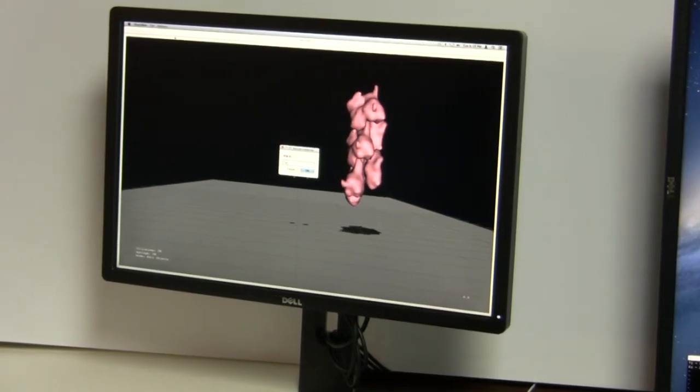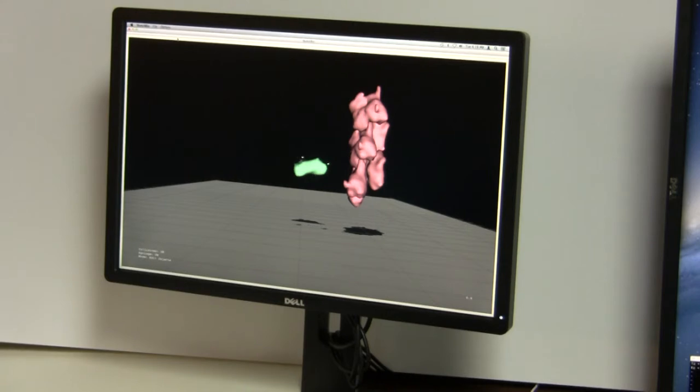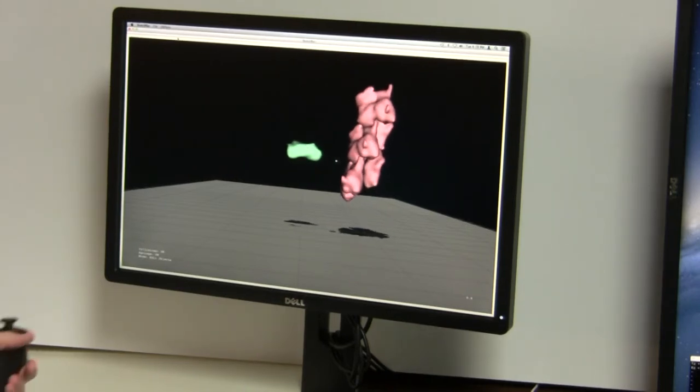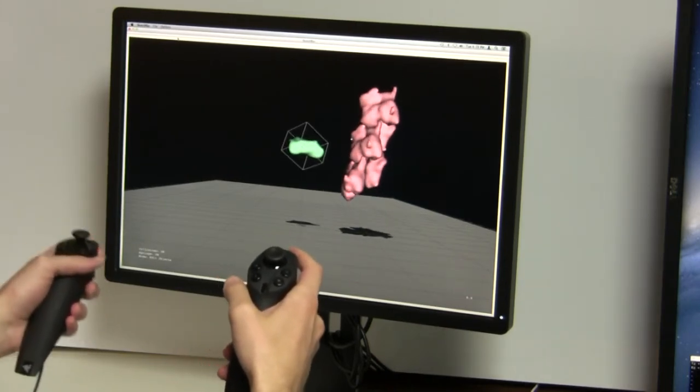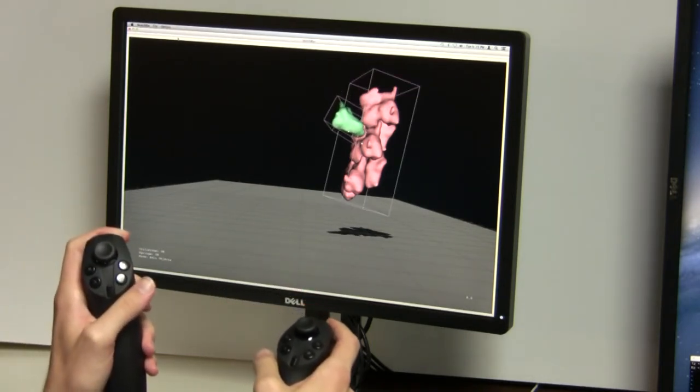The Sketchbio project provides an integrated 3D environment for loading and posing macromolecular structures. Its natural 6 degree of freedom, two-handed manipulation, along with collision detection and shadow plane depth cues, let us finish in 1/5 the time.